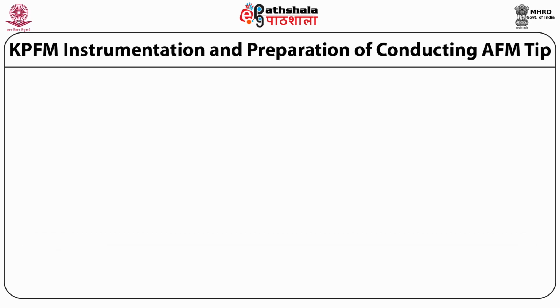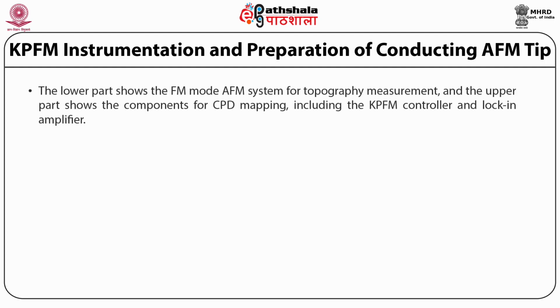This slide talks about KFM, Kelvin probe force microscopy, instrumentation, and preparation of conducting AFM tip. This measurement will be possible if KPFM instrumentation is properly carried out. The lower part of the diagram shown in the slide talks about FM mode, the one which is used for topographic measurement, and the upper part shows components for CPD mapping. Both can be carried out with the help of this particular force microscopy.